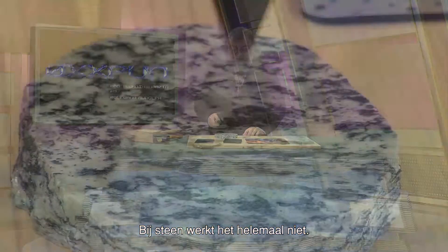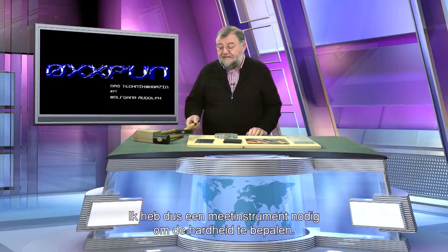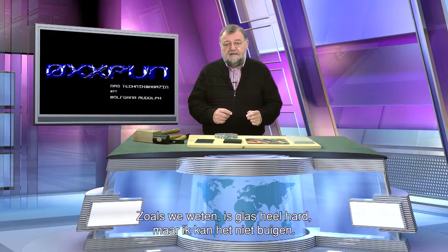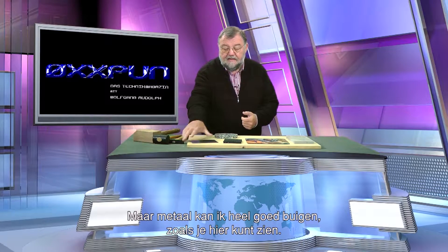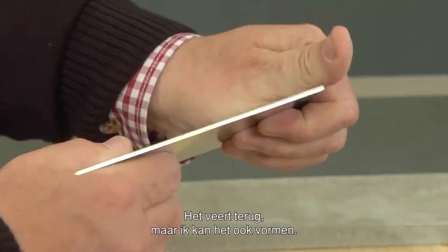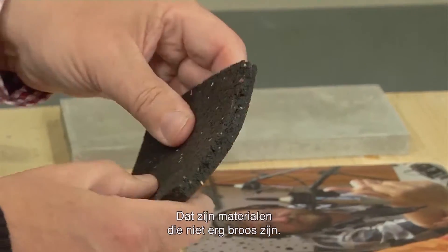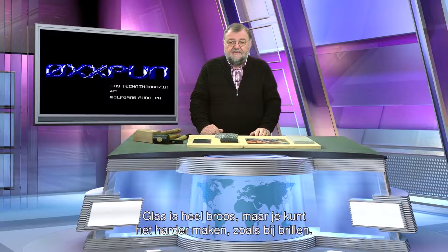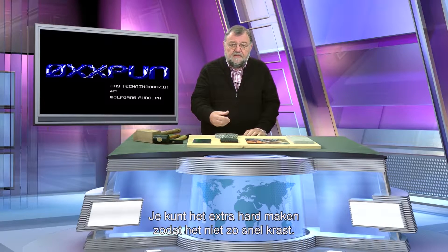With stone that doesn't work at all. I can actually hit it hard and it breaks — but I don't want that either. So then I must have a measuring device to determine the hardness. There is a connection between hardness and brittleness. As we know, glass is very hard, but I cannot bend it. But metal I can bend very well, as you can see here. It springs back, but I can also form it permanently. Rubber I can bend too. So there are materials which are not very brittle. Glass is very brittle. You can make glass harder, as you know with spectacles — you can make them extra hard so that they don't get scratched as easily.